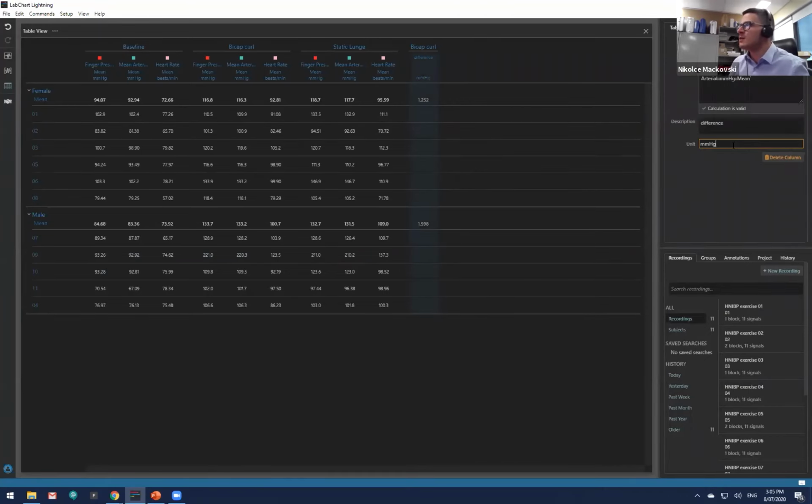But this can be changed. We can obviously change whatever unit we want, and here we can either add any data you want, subtract it, divide it. We have the options of also brackets, so you can add some sort of region calculations in brackets, and you can do some more calculations. And you can see the tool of this, it is quite important. Once again, you could do this in Excel, but it's really handy to have this. And once again, this will also update with the more recordings you have.